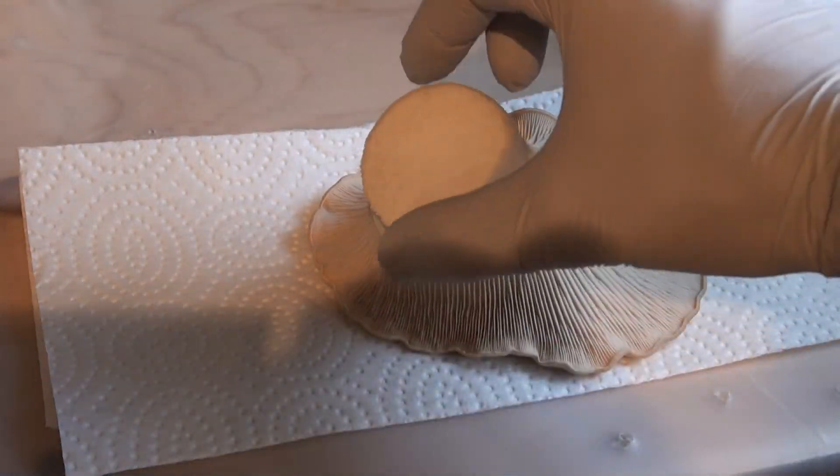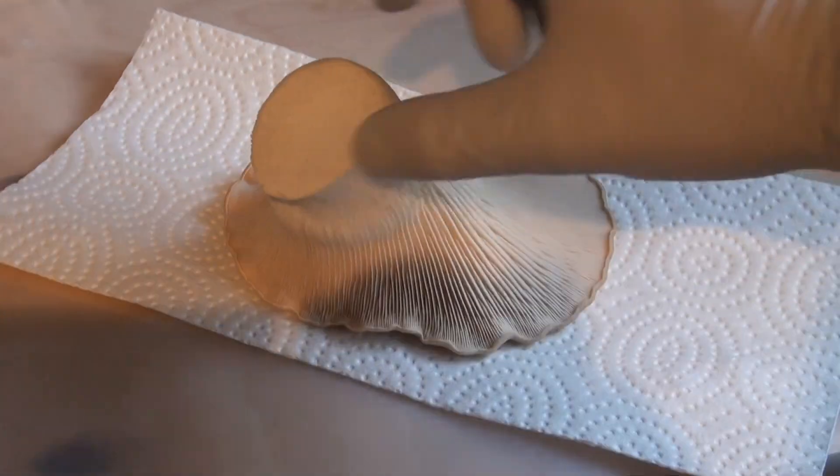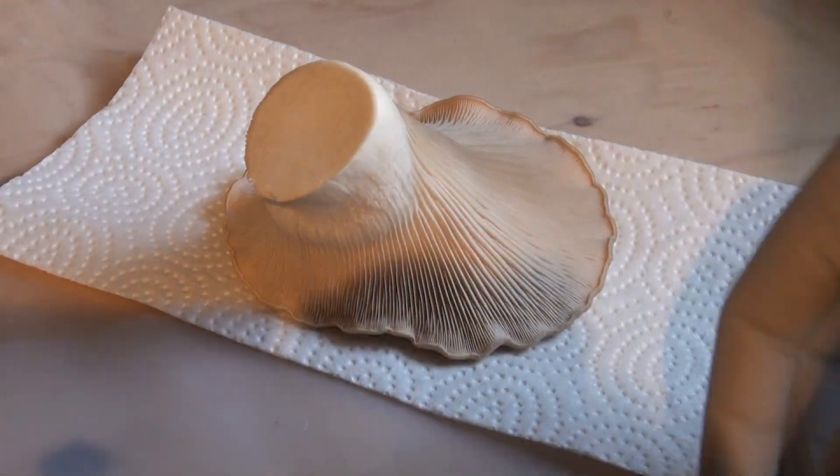So here's the mushroom. I cut off most of the stem. Normally I would just keep the whole fruit body and tear it in half, but since this one is so large, I won't really be able to tear it right in half evenly.